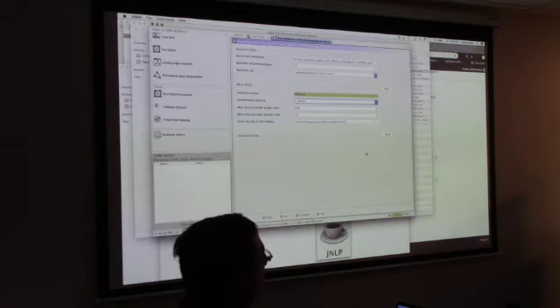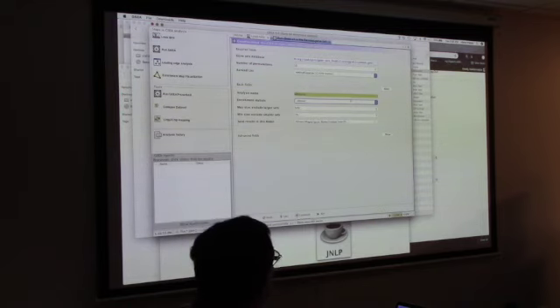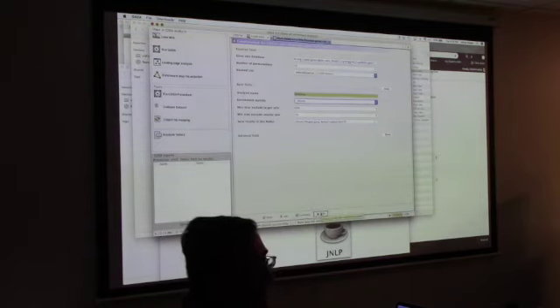Weighted is the default, but that's only for when you're running not RNA-seq, but microarray data and other stuff. But most of the time you'll be running RNA-seq. So make sure this enrichment statistic is calculated the classic way. That's the only caveat. Other than that, you can just go ahead and click run right here in the bottom corner, and it should start running.